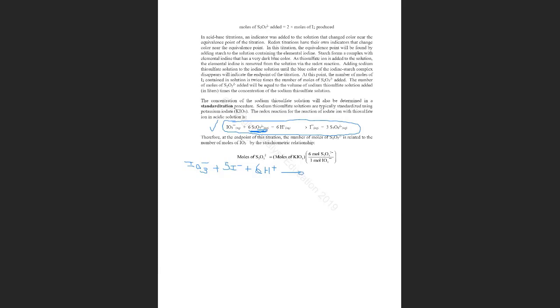And you are converting the iodide into elemental iodine. And then it's easy because of the starch to titrate iodine.